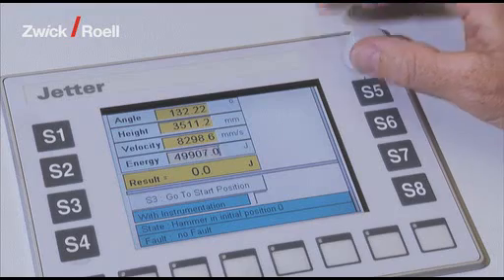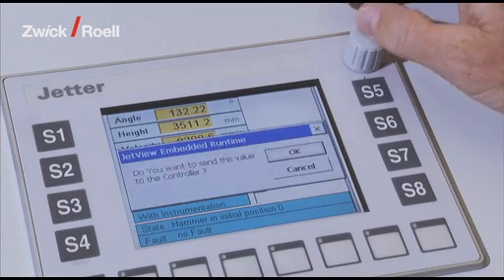First, the potential energy is preset. The level can be selected freely.